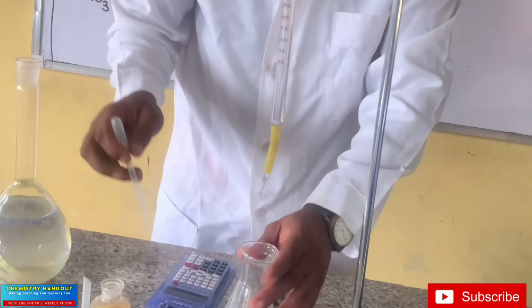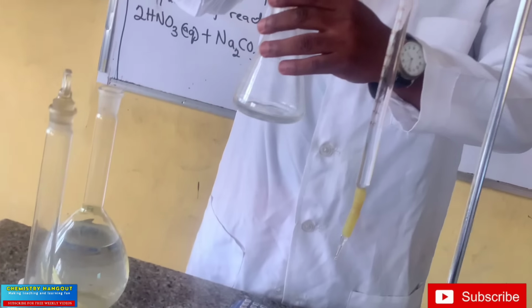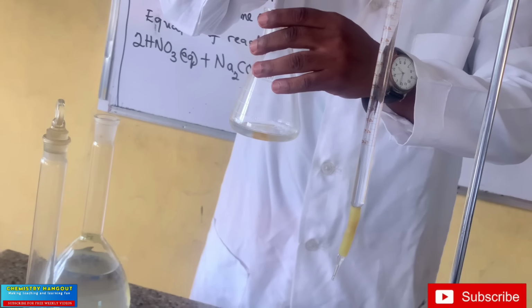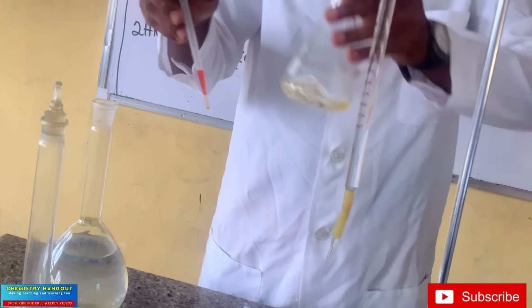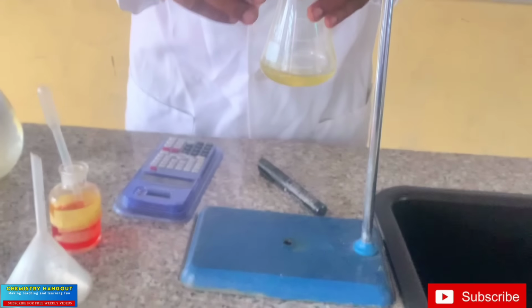So, our methyl orange now, this is methyl orange. I'm using just 2 drops. 1 and 2. You can see the color change now. This is the color change. So, let's go with our titration now.